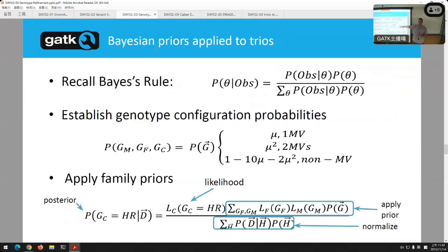So again, if you're assuming there are about 20 de novo mutations per genome, then you can just put that into the mathematics. And you also have to account for the fact that, let's say, both parents are homozygous reference and the child is homozygous variant. Is it possible? I mean, it's possible. Is it likely? No. The probability is the chance of having a Mendelian violation squared, the same Mendelian violation in both haplotypes. But it's possible, so we have to account for it in the math. And that's all accounted for, and that's what we've done here.